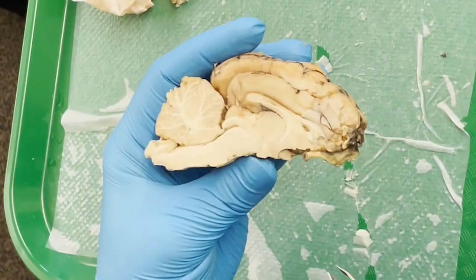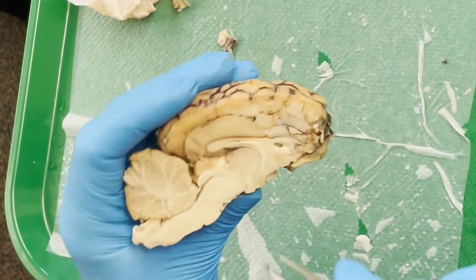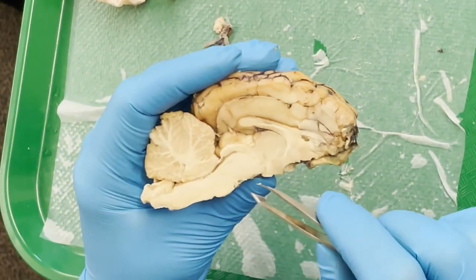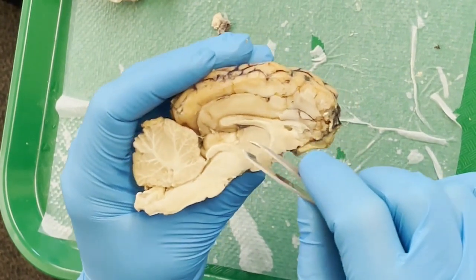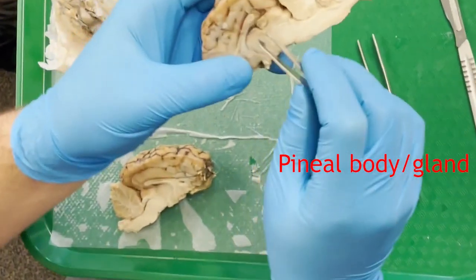Hypothalamus, mammillary body. We've got the pineal body. Yeah, exactly. That's for you, Clara.